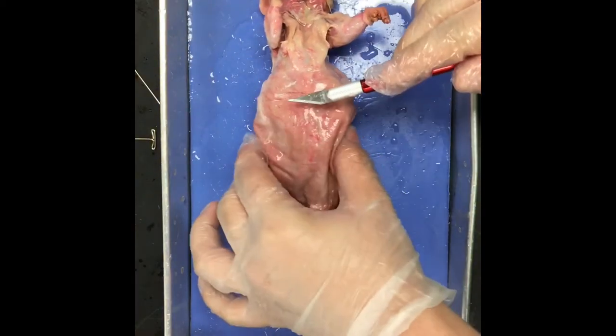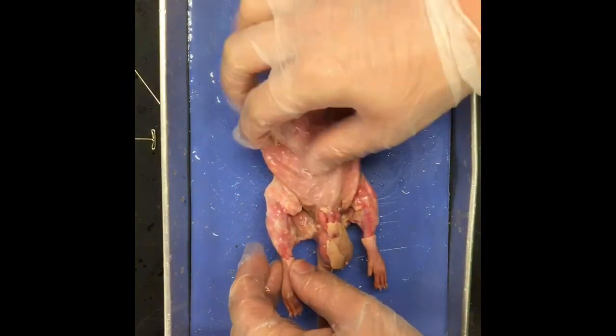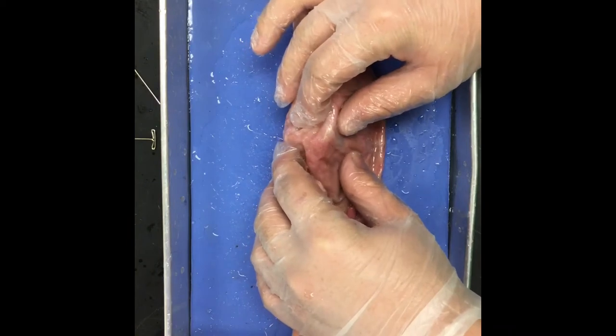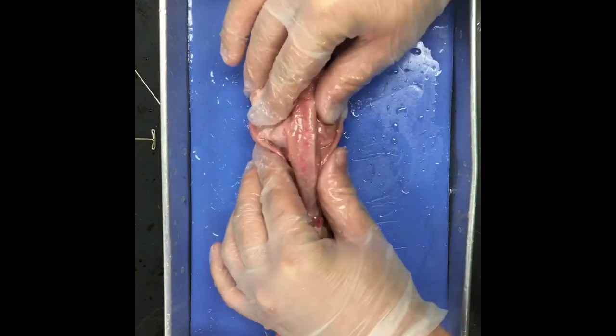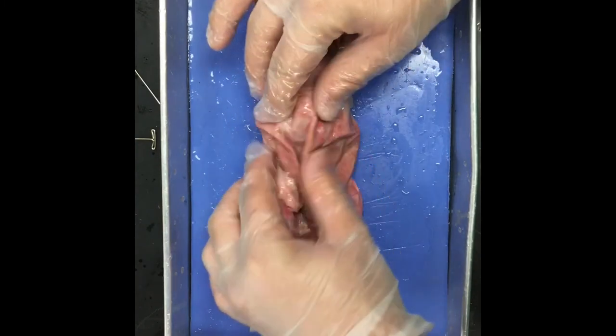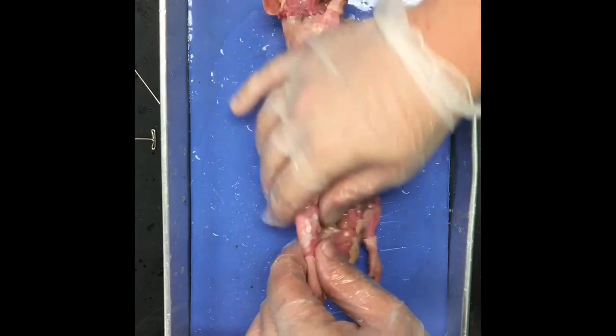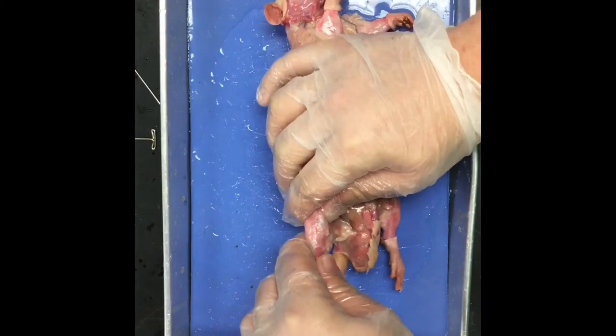Once you've done that, I'm showing you now the skeletal system and the muscular system. The muscular system is all this. This is all skeletal muscle. What if you just see a twitch? Skeletal muscle. It's all skeletal muscle, all the pink you're seeing here. For the skeletal system, you'll have to listen.